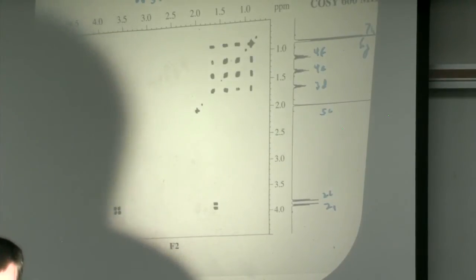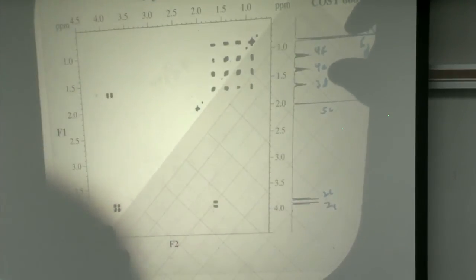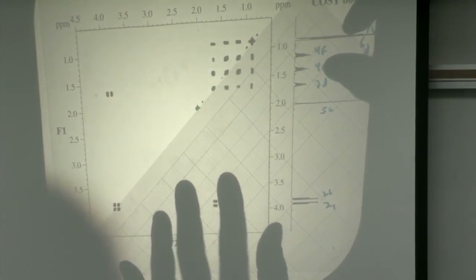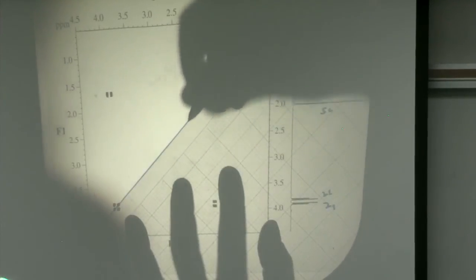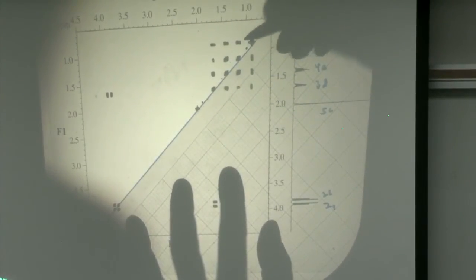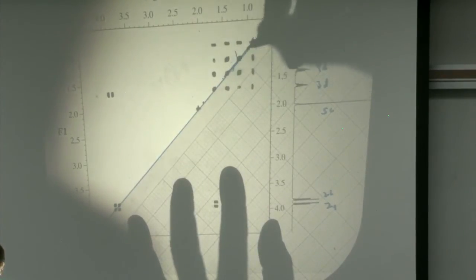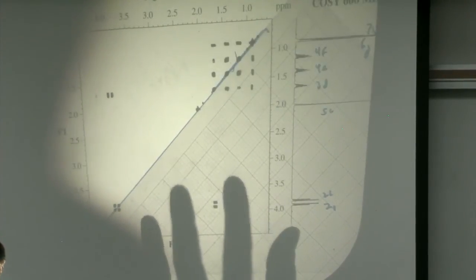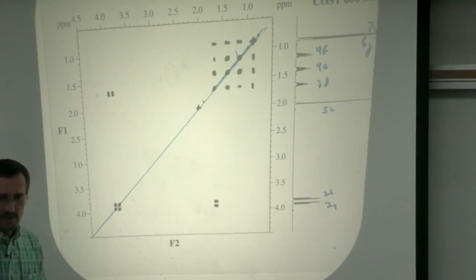All right, so I go through now, I identify my diagonal. I draw a line through my diagonal so I don't get confused. A ruler is better than the side of my grid, but if the grid is what I have on me, then I use the grid. David always comes prepared. He has his ruler.